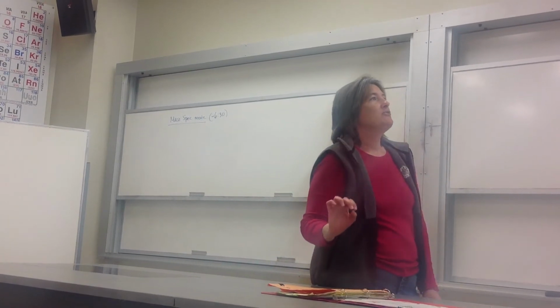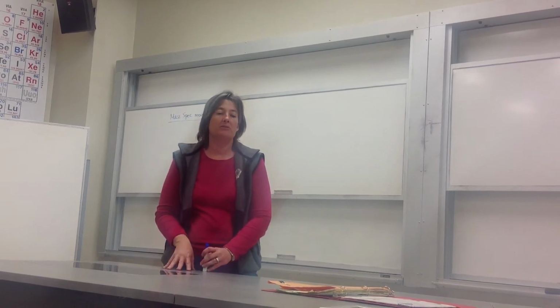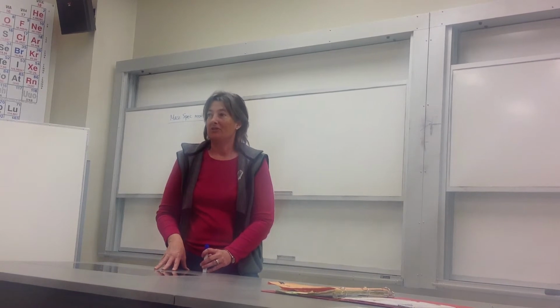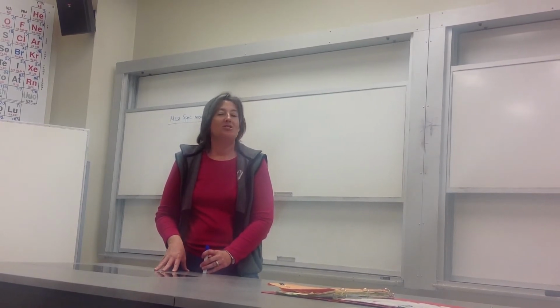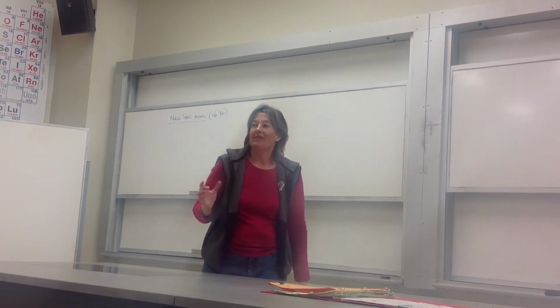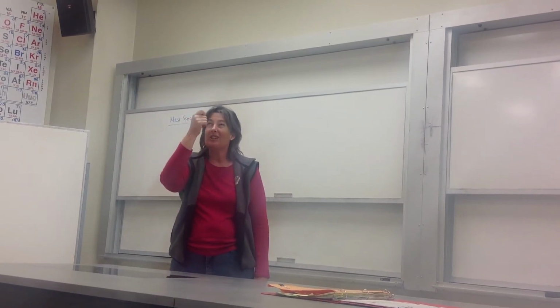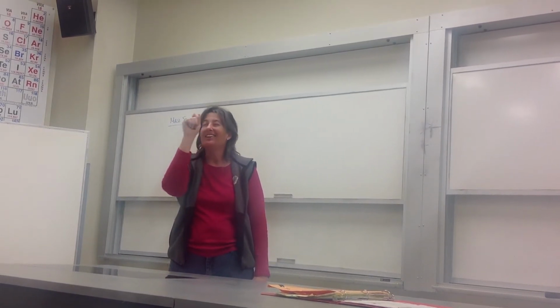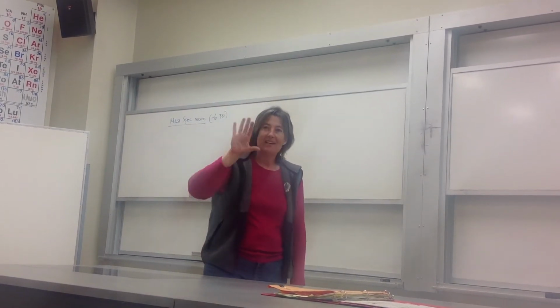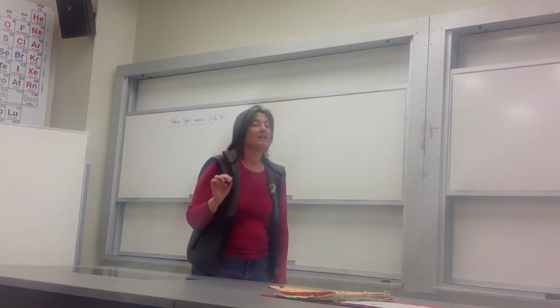One thing that is really nice about it is the sample will be really small. When I was doing my research, my infamous 12% yield, I did not have a lot of sample to send over for a mass spec. I would do an IR, and an NMR, and all that stuff. And what I would have left, literally, look at a vial, it wasn't even a drop. I'd hold it up and say, there's something on the sides, and just shoot over what looked to everybody else like an empty vial. And they were able to take that sheen of oil on the sides and actually get a mass spec off it. So you need really, really small samples.